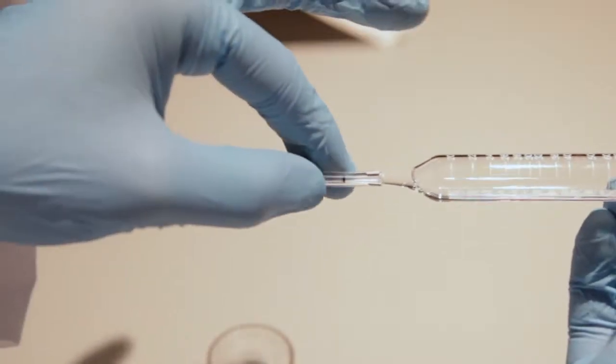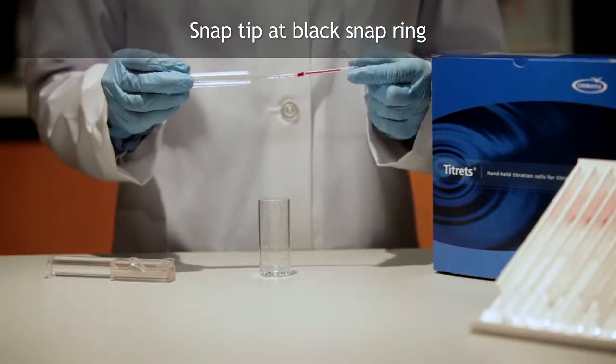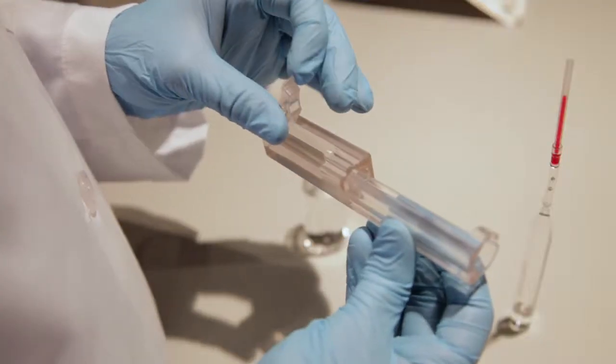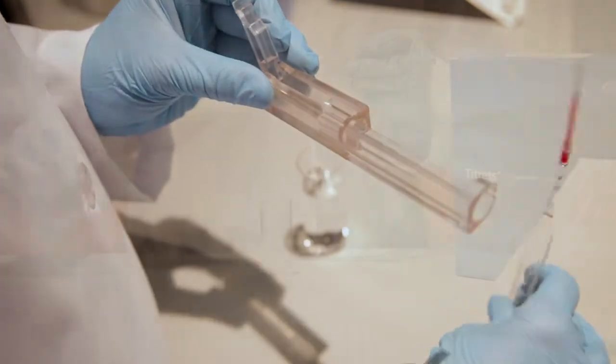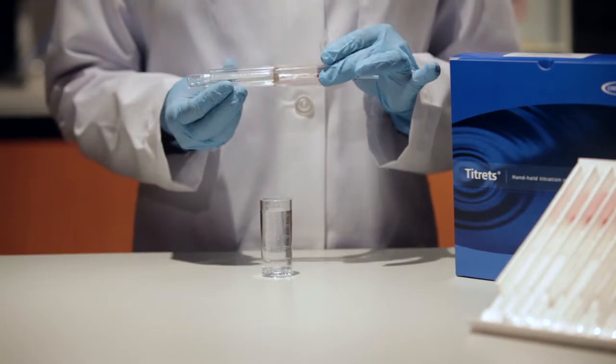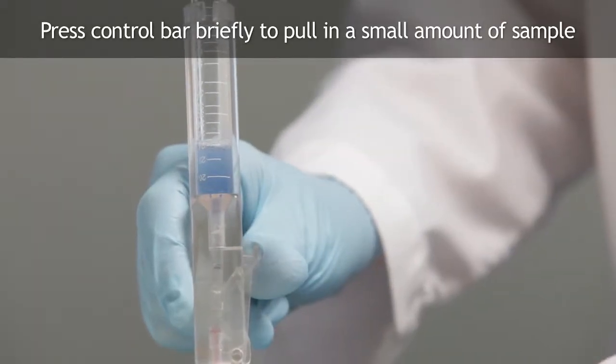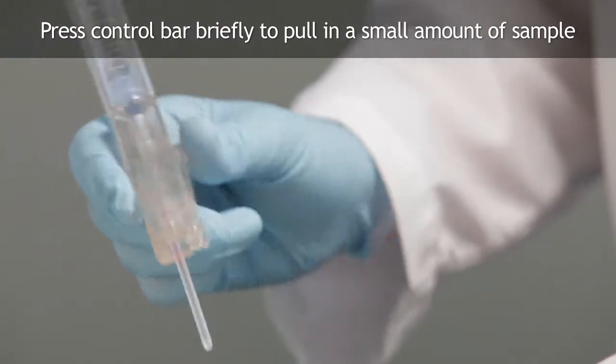Gently snap the tip of the ampoule at the black snap ring. When the tip is snapped, the flexible tubing will remain in place on the tapered neck of the ampoule. Lift the control bar and insert the titret assembly into the titretter. Making sure the tip is immersed well below the surface of the sample, press the control bar firmly but briefly to pull in a small amount of sample.